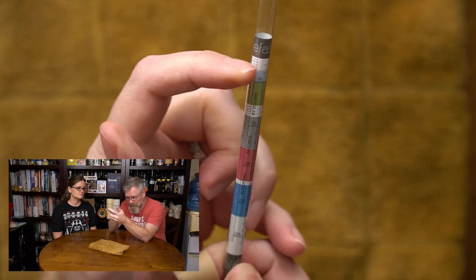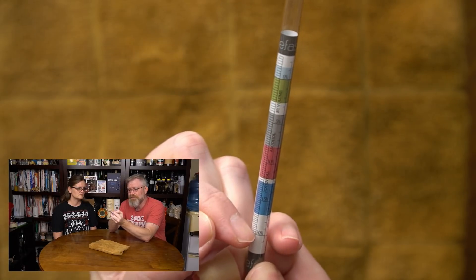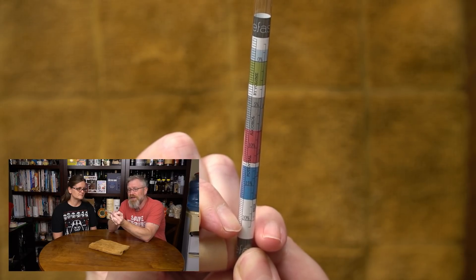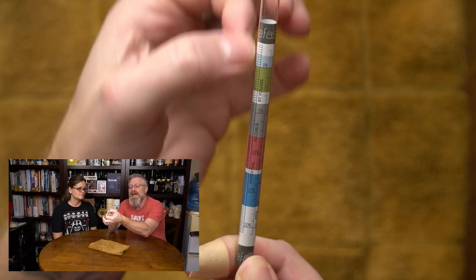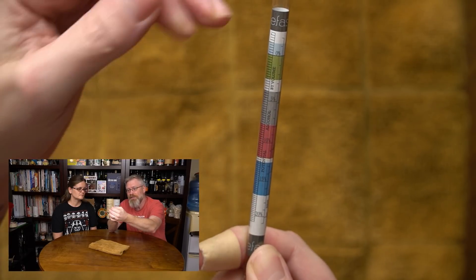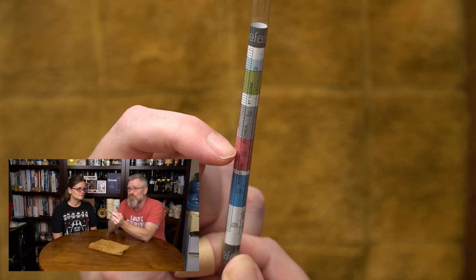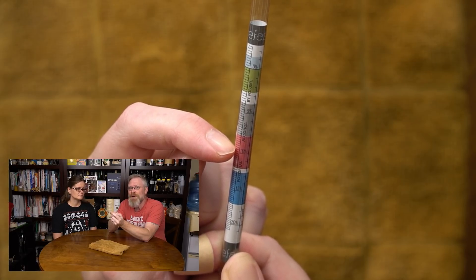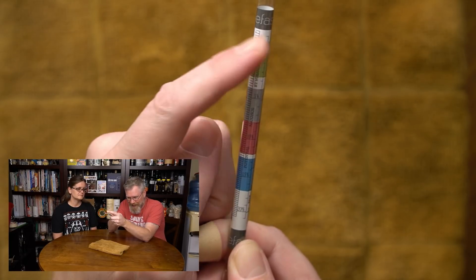Here's where the confusion comes in. If I turn this a little bit — see this? — Alcohol by volume. First, that's bull. They're lying to you. That is only under perfect conditions, if it goes to exactly 1.000 every time. That is your potential alcohol. So if you stick your hydrometer in and it goes up to that one, don't think for a second that that's really a 10% alcohol. We've actually had people think that — that they just made a must, dropped a hydrometer in, and it has 10% alcohol. Don't go by that scale at all.